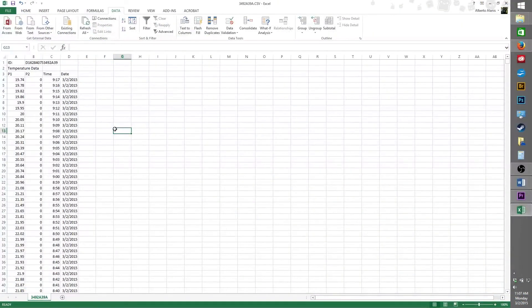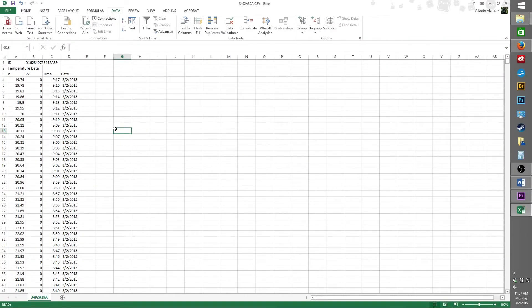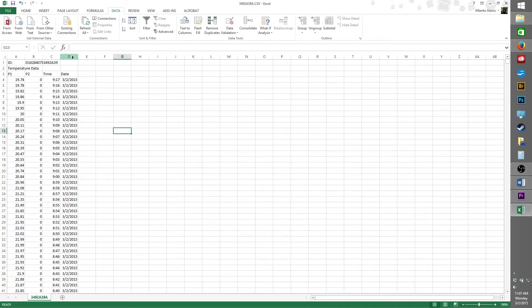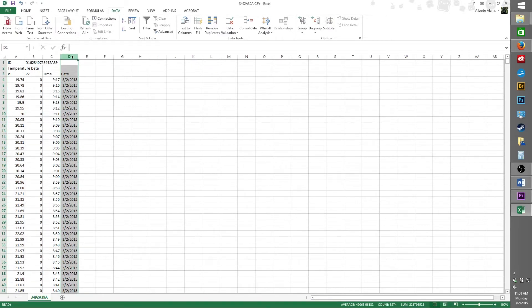First, let's start by filtering our spreadsheet to only show what happened on one day. In this case, my traceable excursion track thermometer began storing data on February 26, 2015, until March 2, 2015. For this example, I only want to view the data that was stored on February 27, 2015. To do this, first select column D. This will select the entire column. Next, go up above and select the data tab, and then find filter. Click on that.